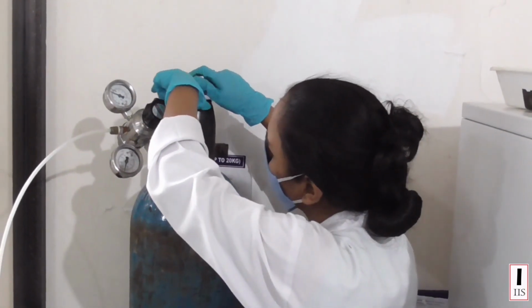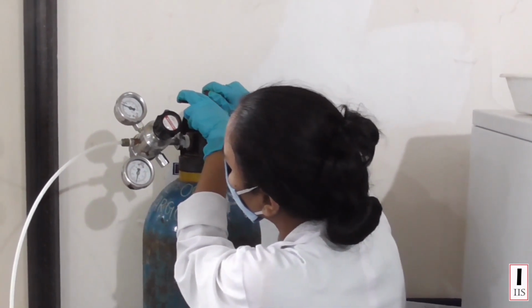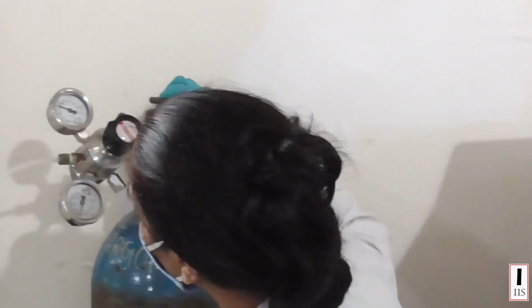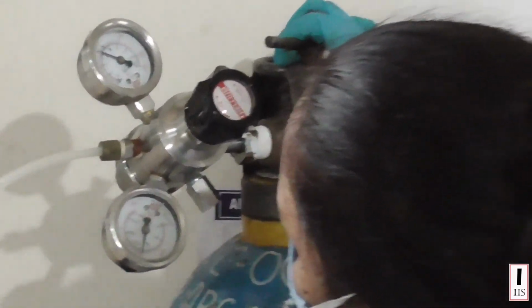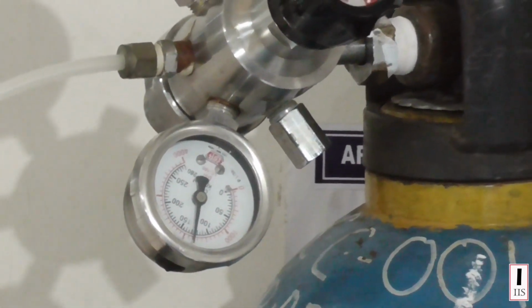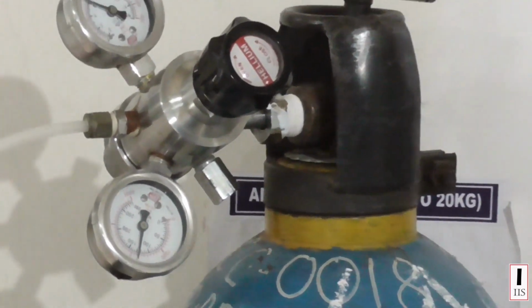Switch on the carrier gas so that the required carrier flow is established. The instrument is then powered on. Let the carrier gas purge through the system for 10 minutes.